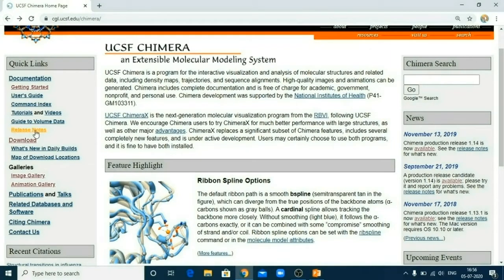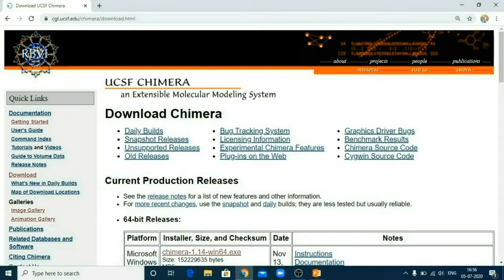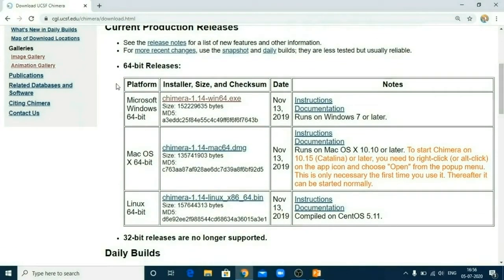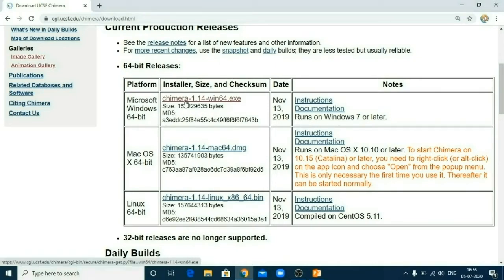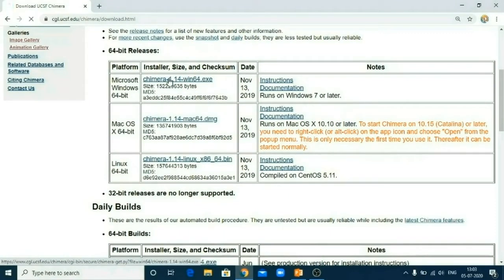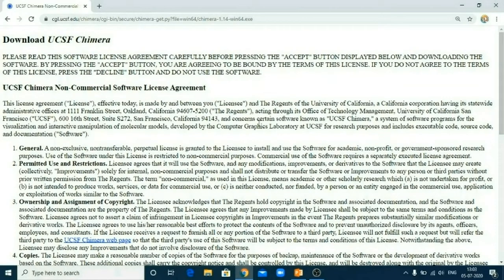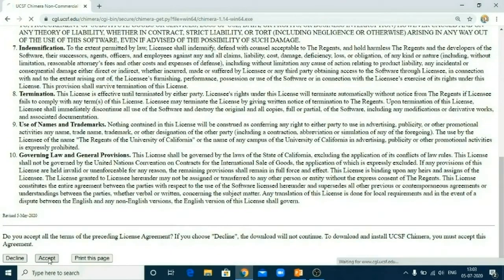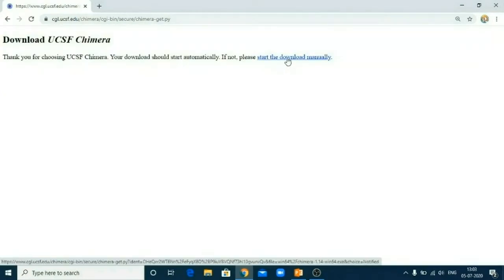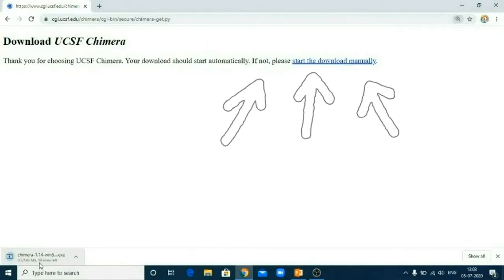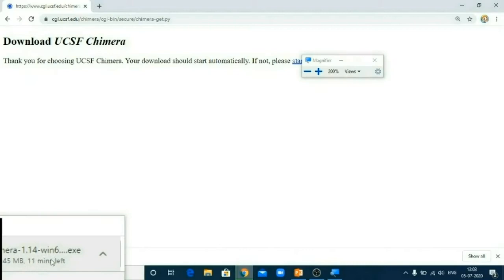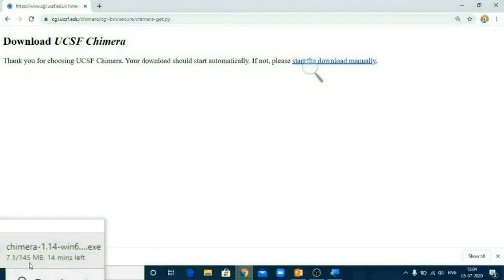So friends, now let's move on and see how to download and install UCSF Chimera. Just click on this download button. Now you can see they are providing links to download UCSF Chimera for Windows, for Mac, as well as for Linux. I have Windows 64-bit on my computer, so I will download this Chimera. Let's click on it. As I click on the Chimera installer, it will open an agreement I have to accept.